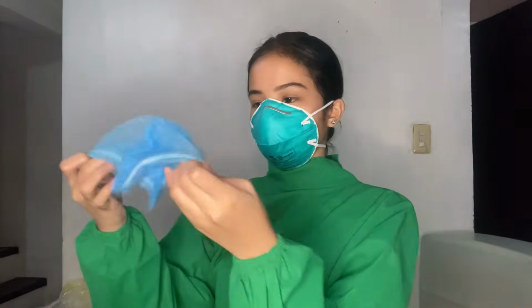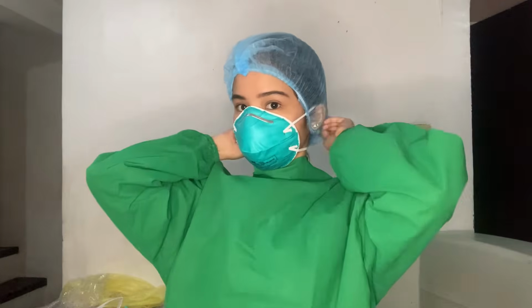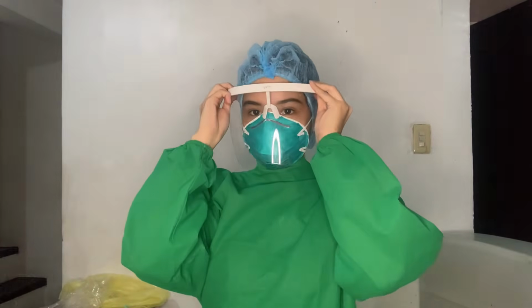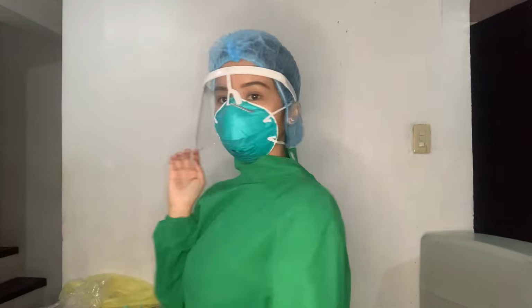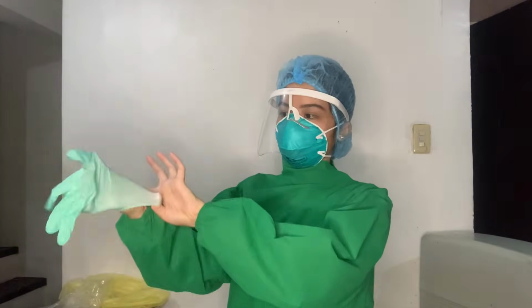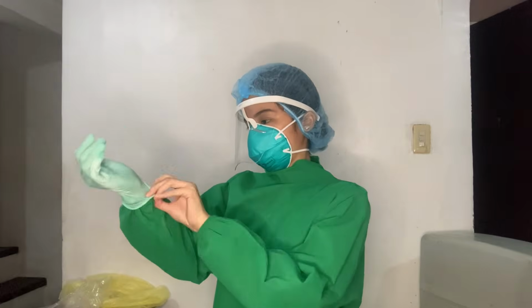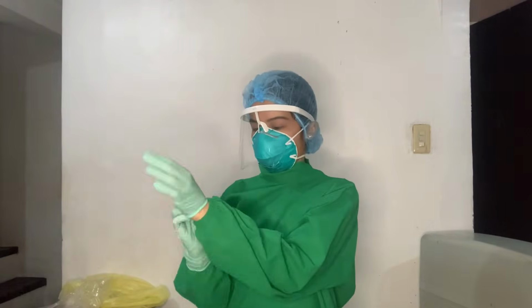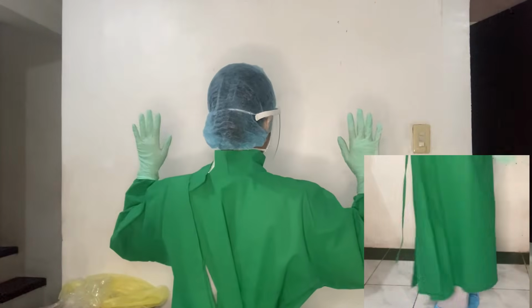Now we're going to wear our bouffant cap. Wear your goggles or face shields. Now we're going to put on our clean gloves. When you're wearing your clean gloves, securely tuck the cuffs inside each glove before entering the room. We're now all set and ready to enter the room.